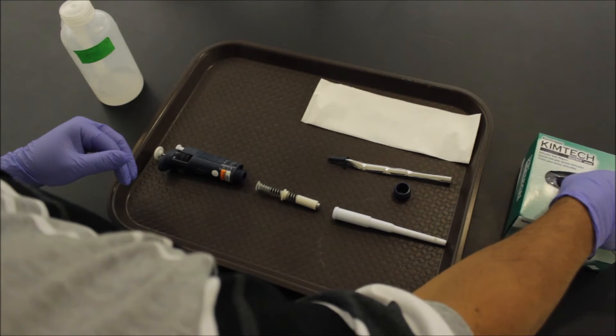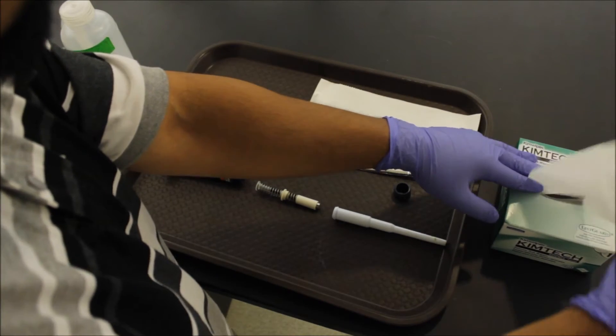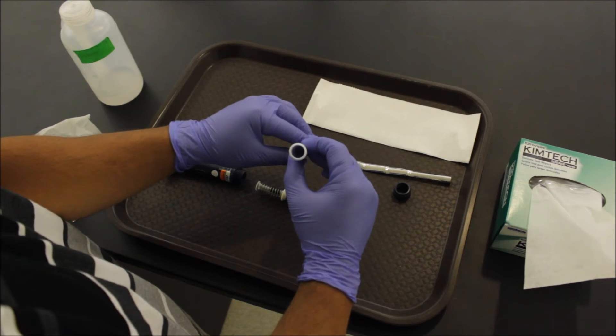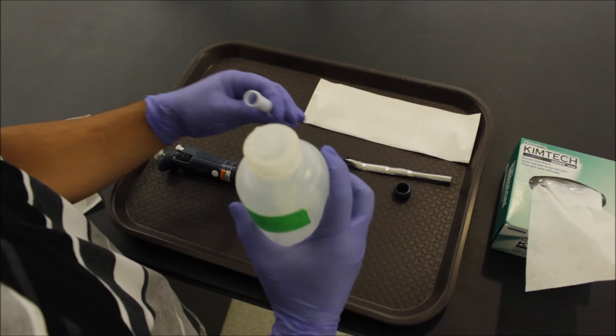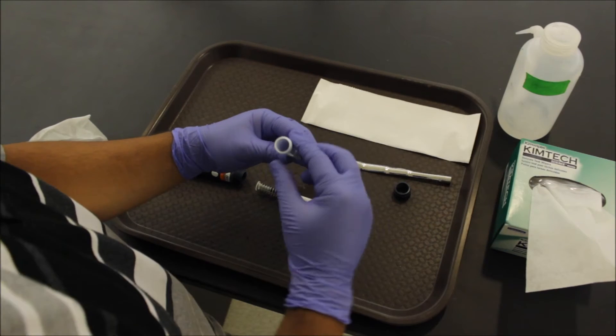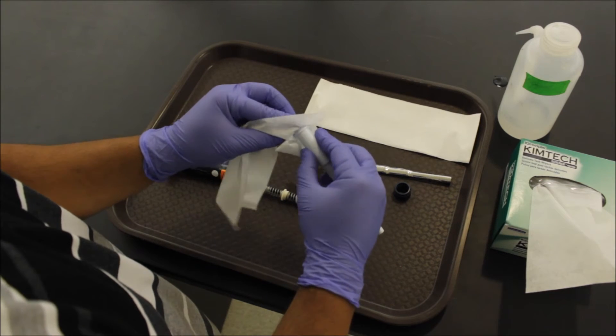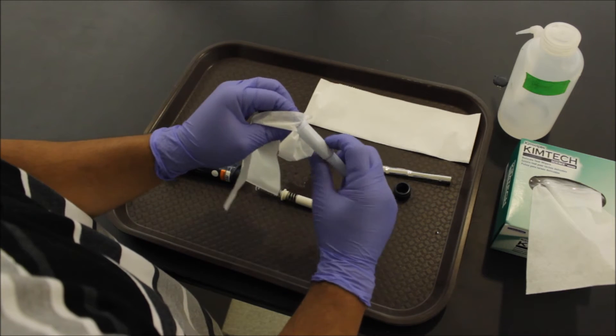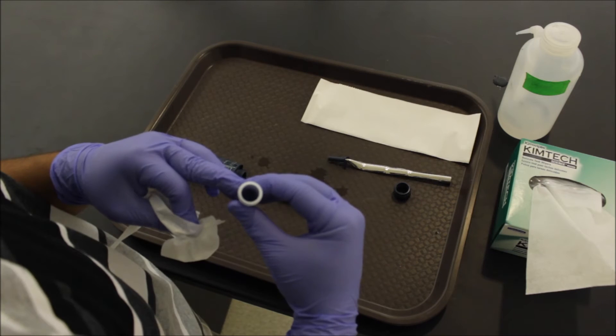Grab your chem wipe. Right here you want to look down the barrel of your pipette. Make sure there's no goop or debris. If there is, go ahead and give it a little spritz of ethanol. You can use as much ethanol as necessary right here. Give it a wipe. Feel free to be aggressive here. Take another look.